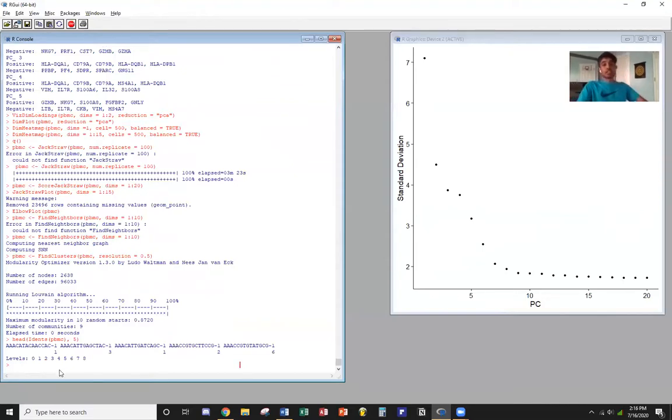These are many nonlinear techniques that are provided by Seurat. These include tSNE and UMAP to explore the data set. So that's what we'll be doing next. Let's run a UMAP here, or UMAP, however you wish to say it. I believe that both of them are a correct way to pronounce it.